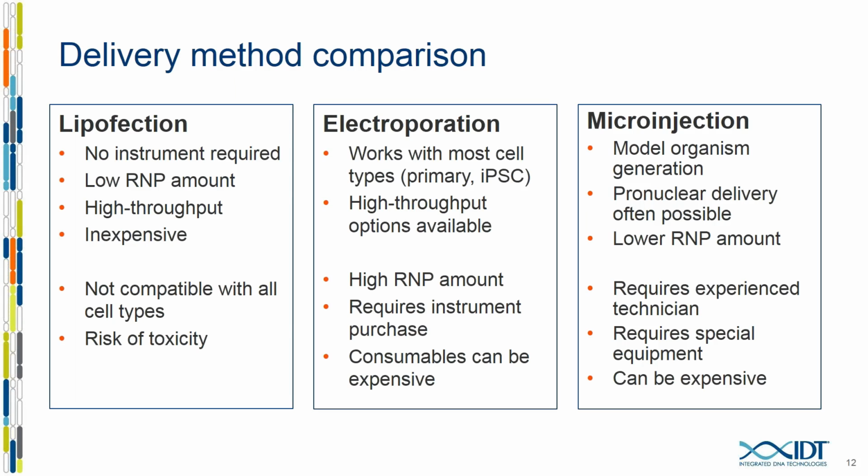Lastly, for microinjection, this is, of course, much more model organism related. So if you're interested in making a new mouse strain or you're microinjecting into zebrafish or C. elegans, this is typically what's used.